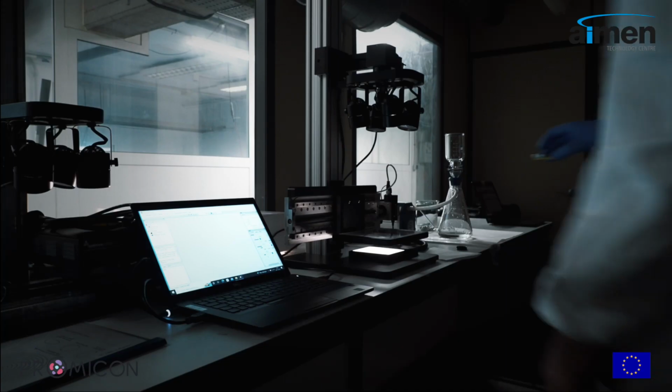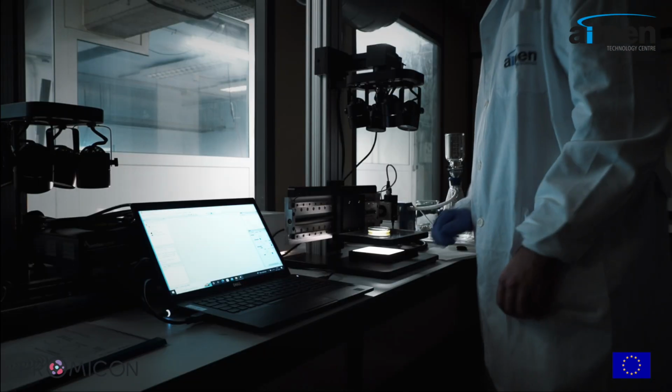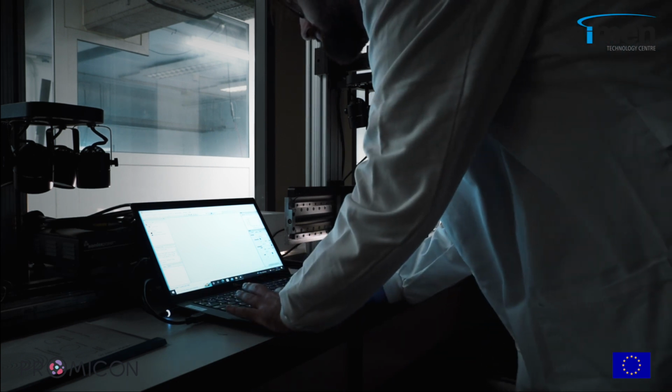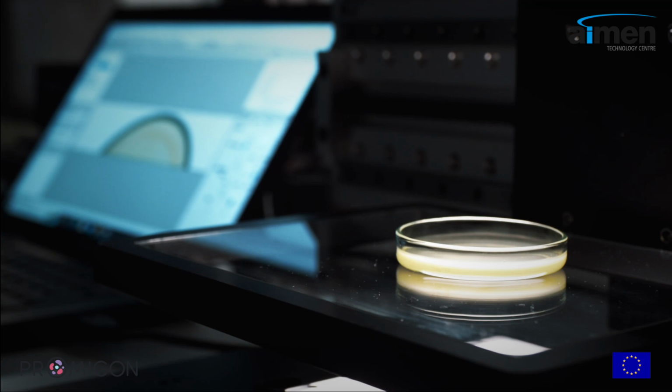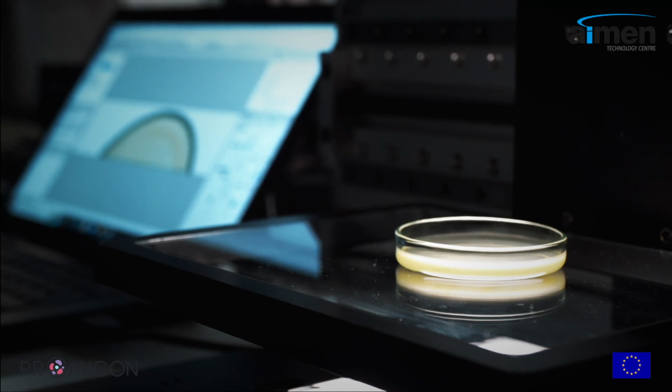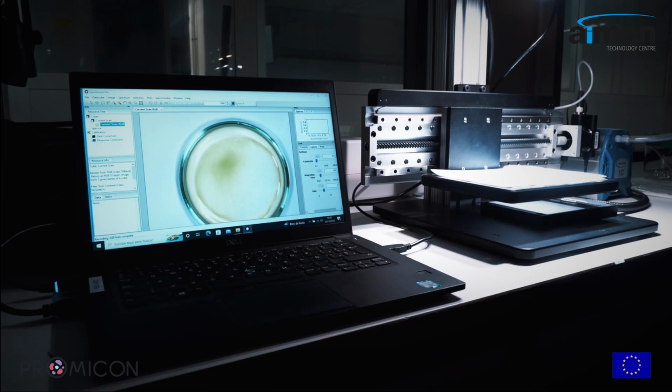Secondly, in order to determine the biomass content, we use a commercial hyperspectral camera to characterize the microbiomes during their growing stage. The sample is placed under the moving platform and then the measurement starts. As the sample is scanned by the camera, the spectral information of the reflected visible light is recorded line by line, generating a so-called hypercube. Through this data, a reconstructed image is obtained, where every pixel is associated with the spectral reflectance of that area.